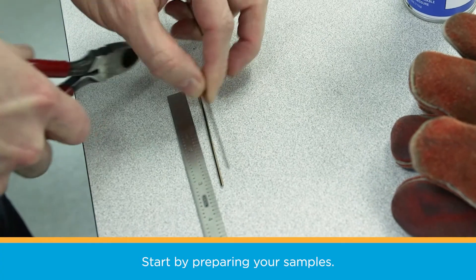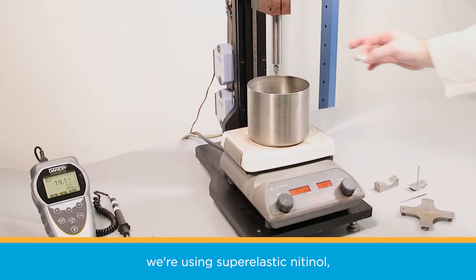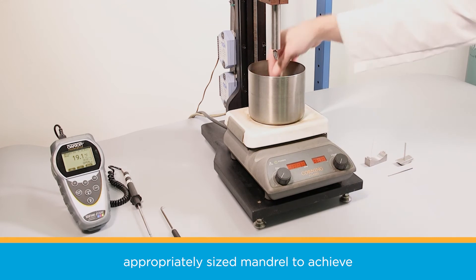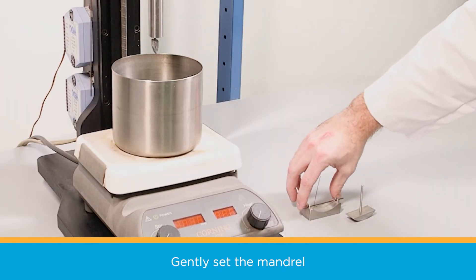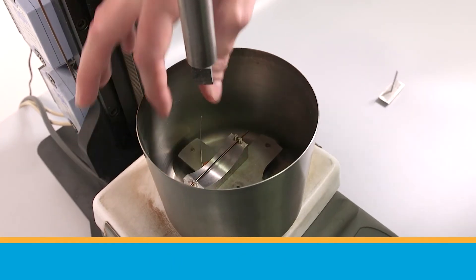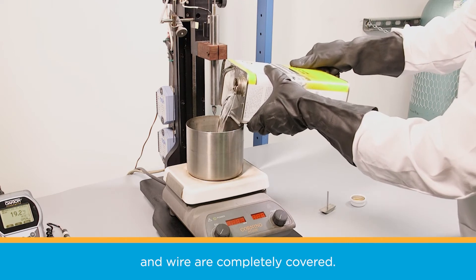Start by preparing your samples. For this demonstration, we're using superelastic nitinol, which should recover below room temperature. Place a sample in an appropriately sized mandrel to achieve 2 to 2.5% strain. Gently set the mandrel in the bottom of the container, and wearing safety glasses, slowly add denatured alcohol until the mandrel and wire are completely covered.